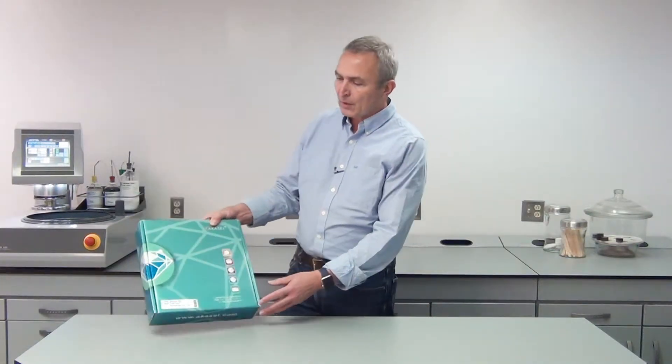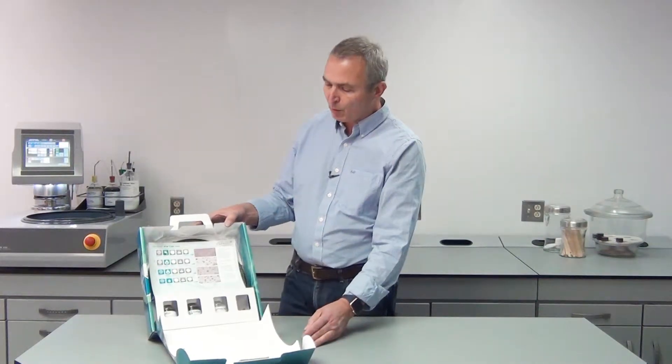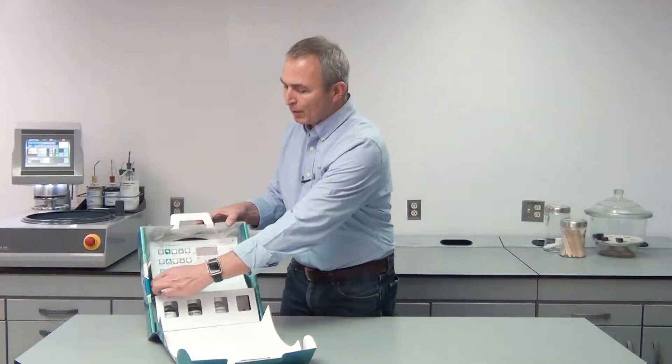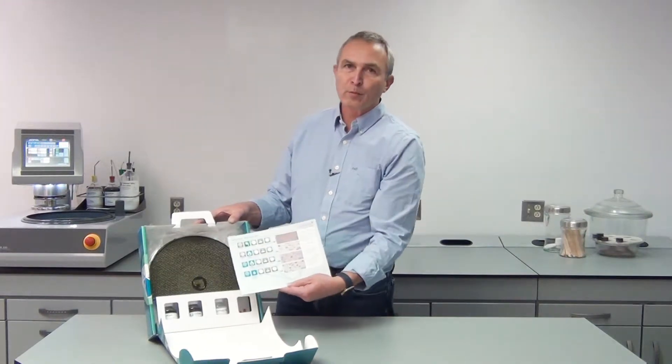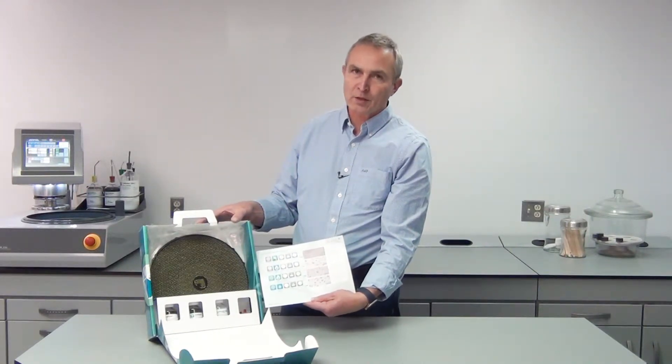If you would like to try some of our consumables, I can recommend our demo kit. This is available for various materials and it contains all the necessary consumables and a preparation method detailing the different preparation steps including times, forces and so on.